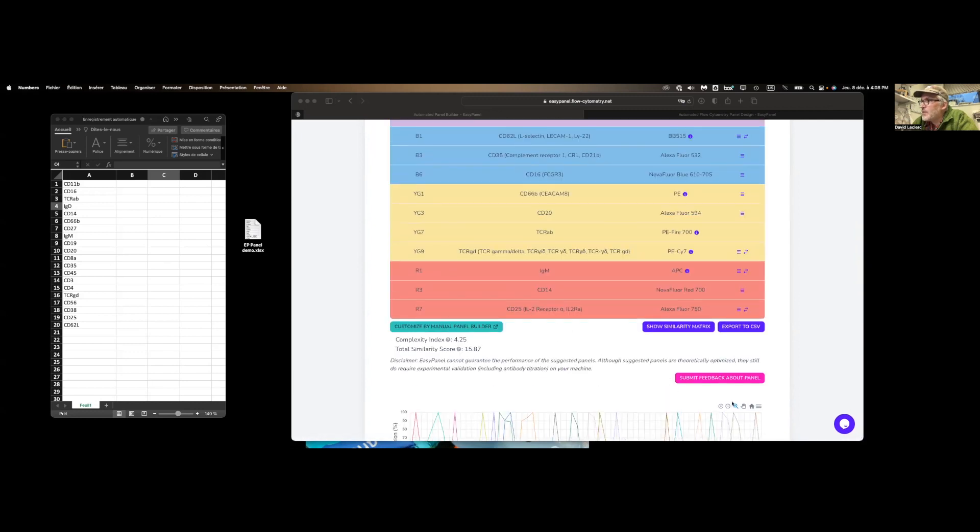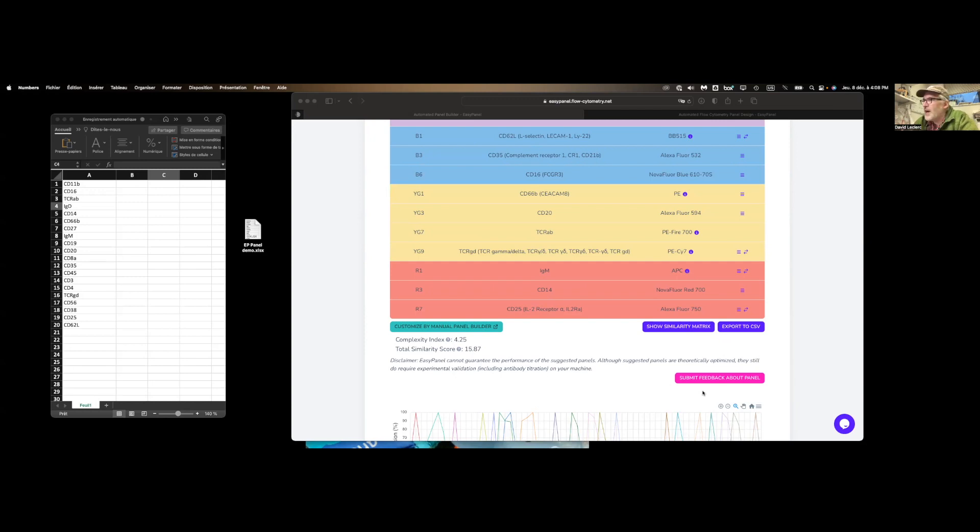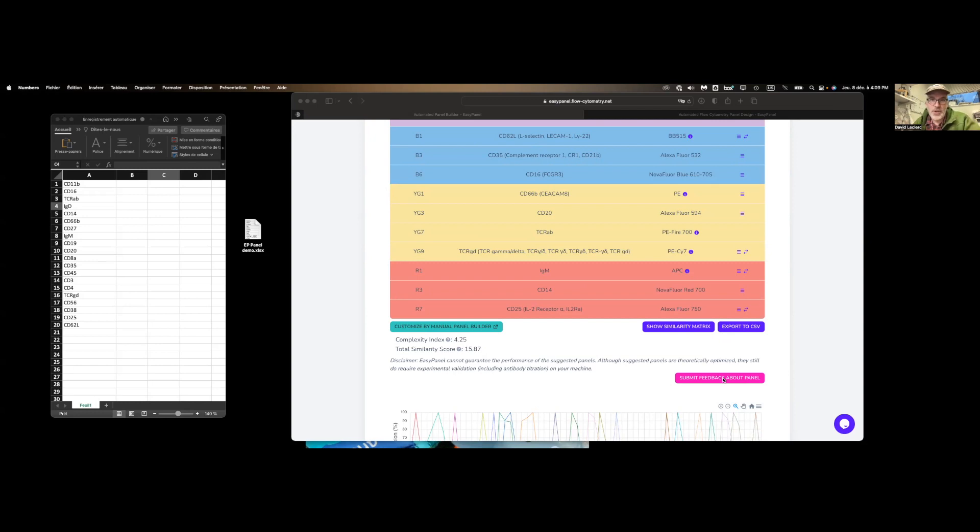The other thing we can do is submit feedback about the panel. So if you find that the panel suggestion does not fit your needs at all, write back to the team behind this EasyPanel. And they will tweak the algorithm and make it work better. And so over time, the tool will only get better.